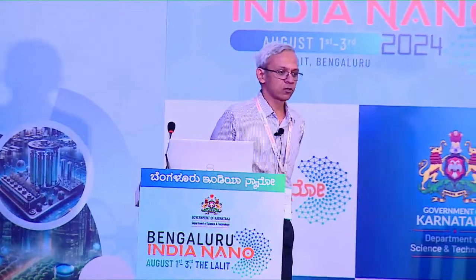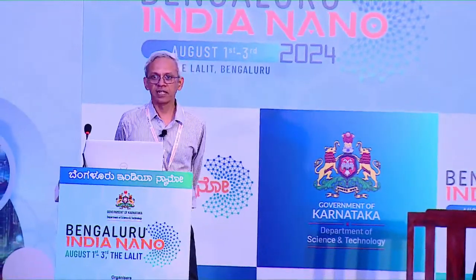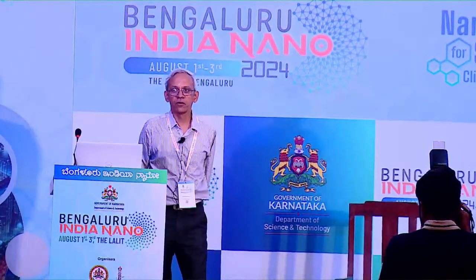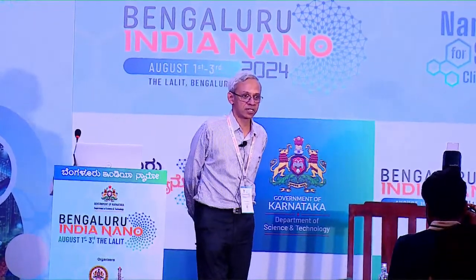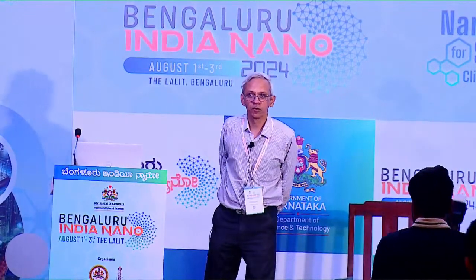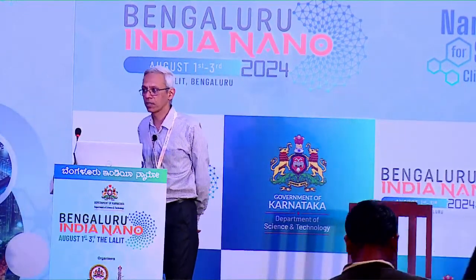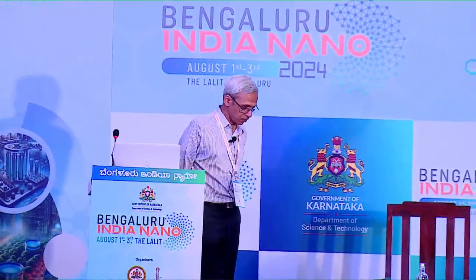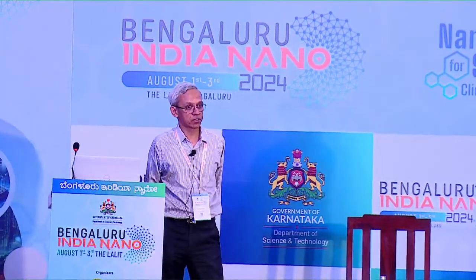I took the liberty of slightly changing my topic. It's still going to be on electron microscopy, but my abstract says I'm going to talk on SEM as well as TEM, but I thought in 1 hour and a little bit, it's not possible to do that. So what I'm essentially going to do is talk about the state of transmission electron microscopy, one of the most indispensable tools for nanostructured materials, nanomaterials in particular. I'll try to tell you in the next hour what electron microscopy can do in terms of characterizing nanostructures, and particularly what we can do at the atomic scale.